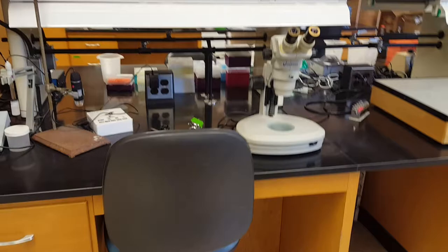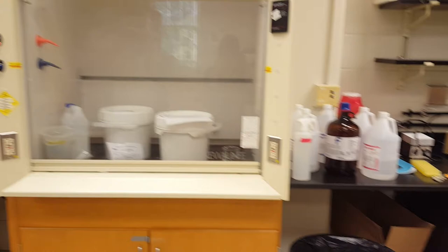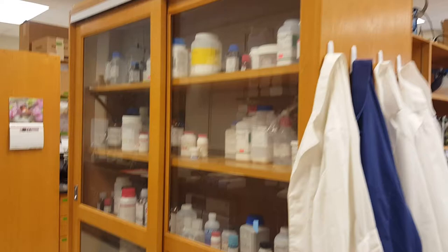On the opposite side of the room we have our fume hood. This is where we work with hazardous chemicals and it prevents toxic fumes from getting into the lab space. On this counter here we have a sink and several scales that we can use to weigh out chemicals. And in this cabinet you can see where we store a lot of the chemicals and reagents that we use in experiments.